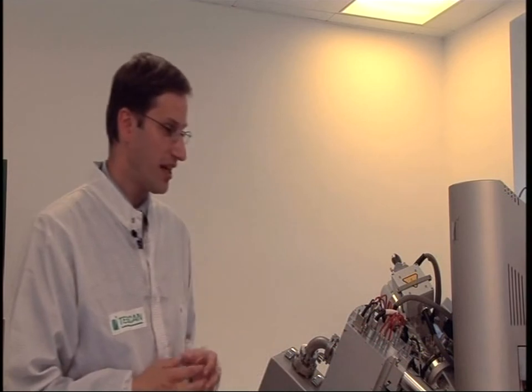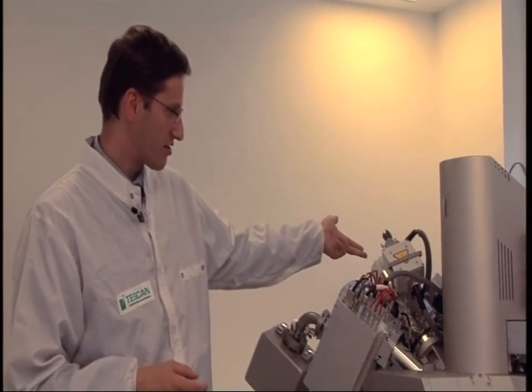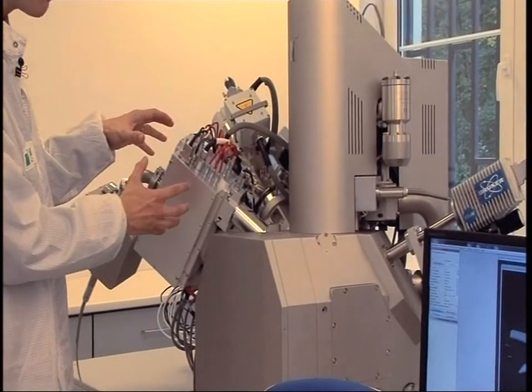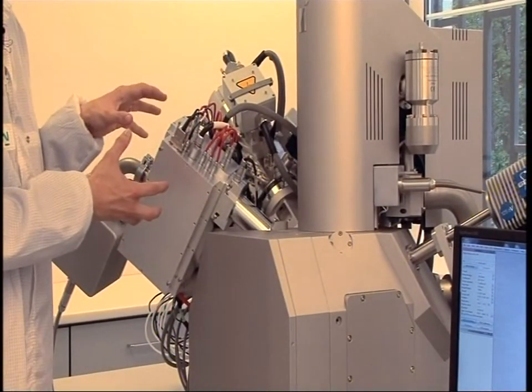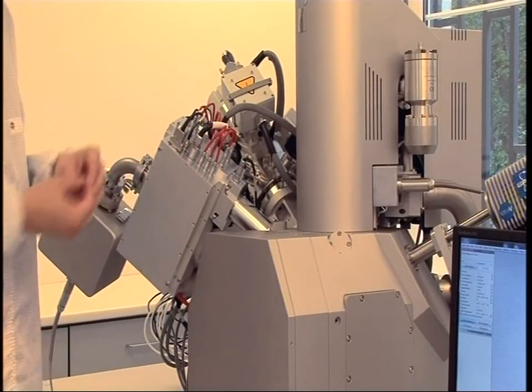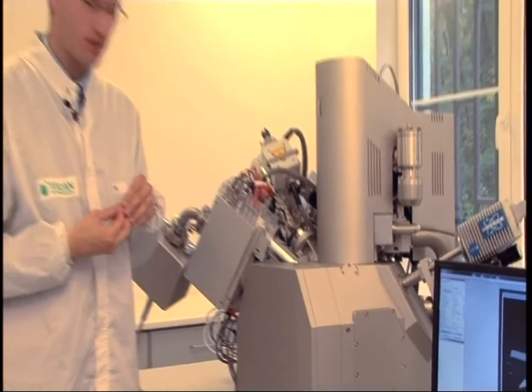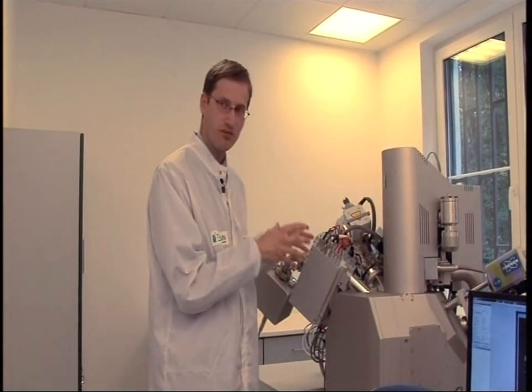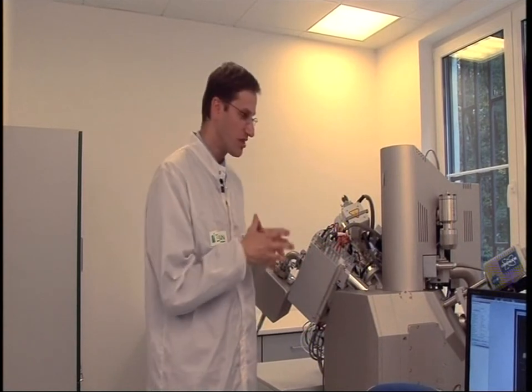We have utilized the fact that we already have a source for a focused ion beam. And by only adding such a small, compact device, we are able to use this method of TOF mass spectrometry in our combined device. This makes it truly unique in the world.